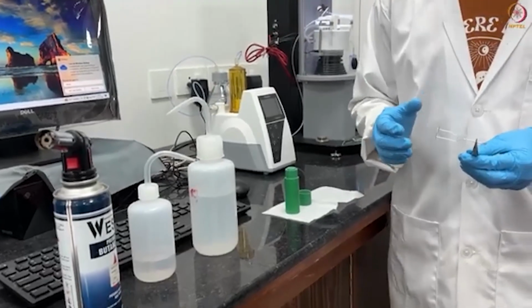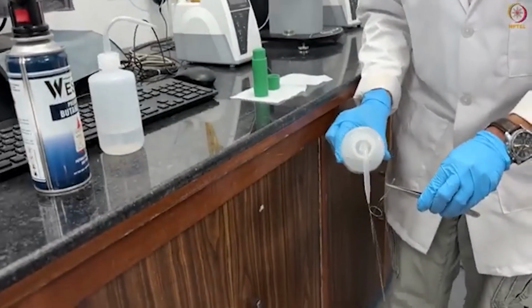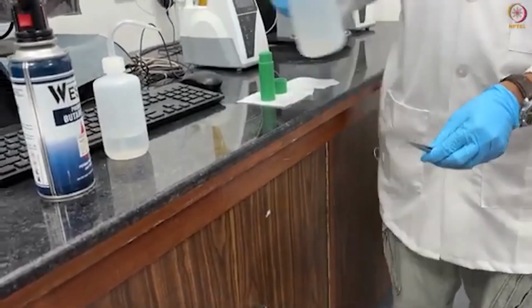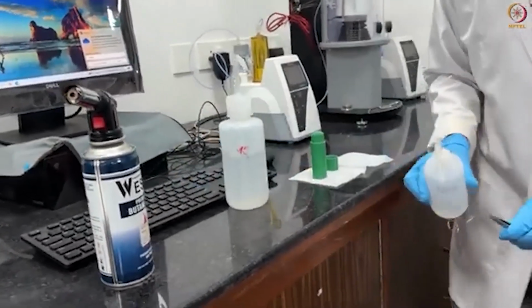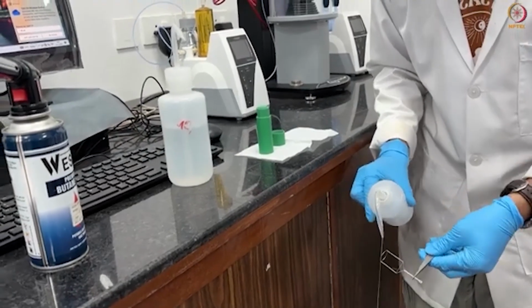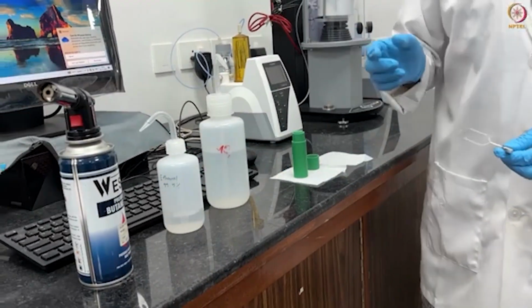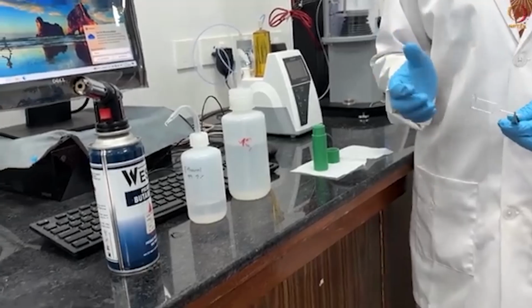For the cleaning procedure, first we will clean using DI water. Then we will rinse it with ethanol for thorough cleaning. Cleaning is a critical step in this experiment, especially for a tensiometer, whether optical tensiometer or force tensiometer.